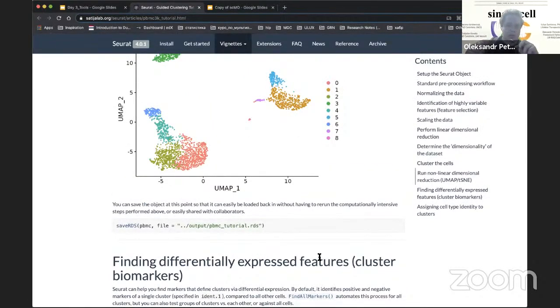Number one, I know which markers my cells usually express. So for example, if I study hepatocytes, I know that albumin and some specific receptors and channels are specific for these cells. So I can just take a look at which clusters express these markers. Usually it will be a few clusters. In this case, I will say, okay, this is a hepatocyte cluster: number 1, number 2, number 3. The same goes for any markers I would specifically want to measure, or if I care only about these markers.